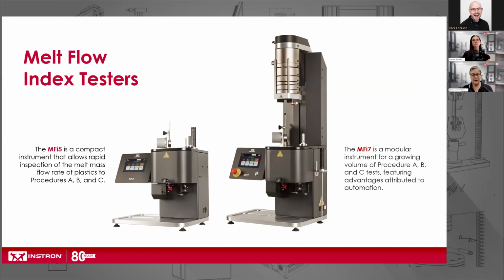So melt flow testers, as I said, are very standards-driven systems, but you could have something as simple as a very simple system, such as the one on the left. The system is a manual task; the operator will need to time the task and apply the masses manually. It's a good system if you are only going to test one or two materials. You're only going to need to use one or two masses to run those materials.